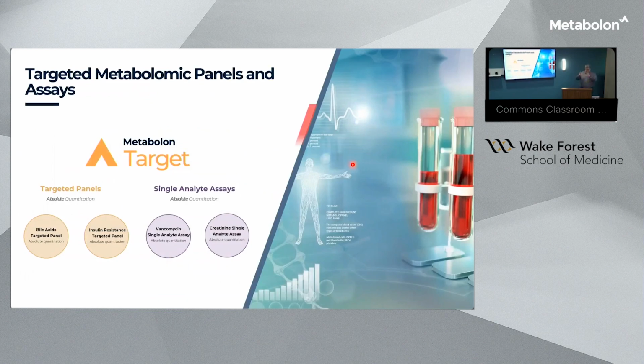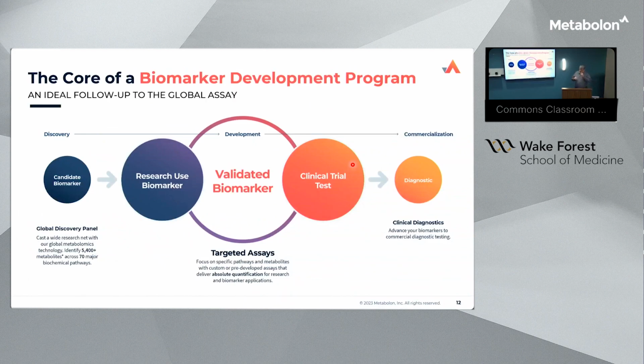Now to another set of targeted panels that we have. This is a quite reduced number of metabolites, usually on the order of 5 to maybe 20 metabolites per panel, but some of them go to 61 metabolites. This fits very nicely into the pathway that I showed in the slide. We use the global discovery panel to search for these unique metabolites or sets of metabolites that are indicative of the biology.